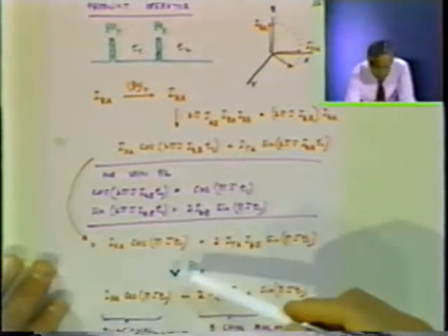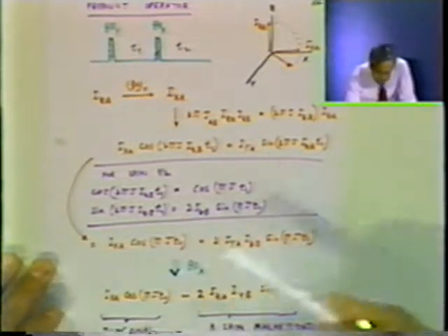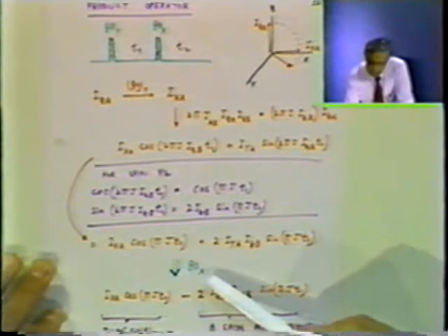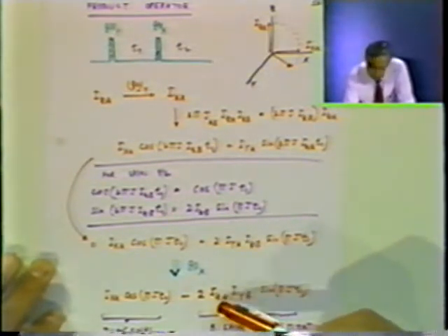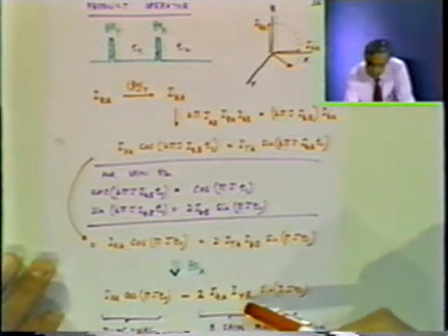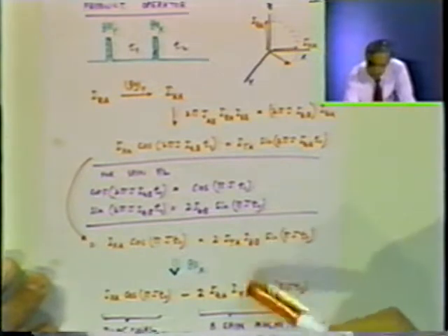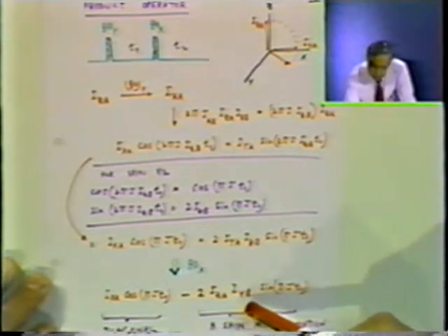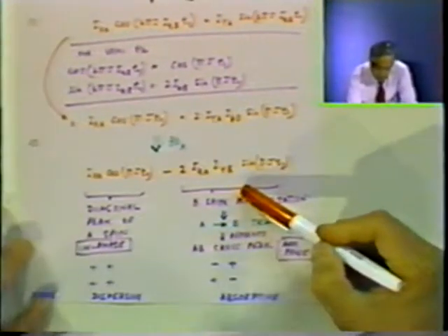And when we apply the 90-degree X pulse on this state of the spin, the X component is not changed because the pulse is along the X-axis. This component is changed. The Y component becomes a Z, and the Z component becomes a Y. And this is the point that you notice: a transfer of magnetization from A to B magnetization. Okay, and this is the interesting step.